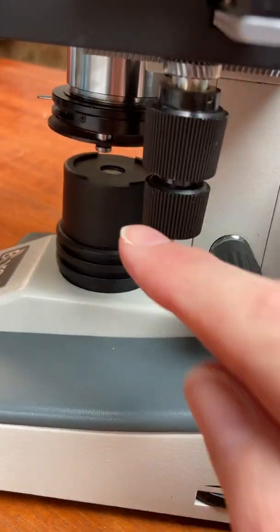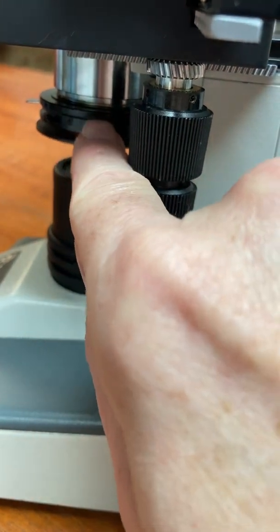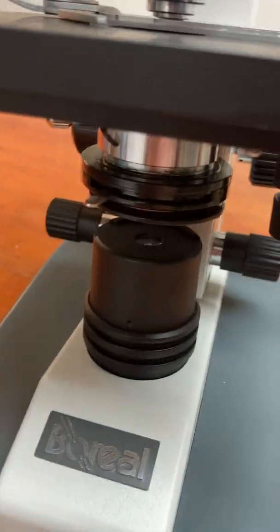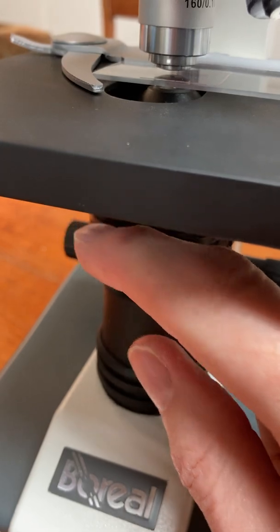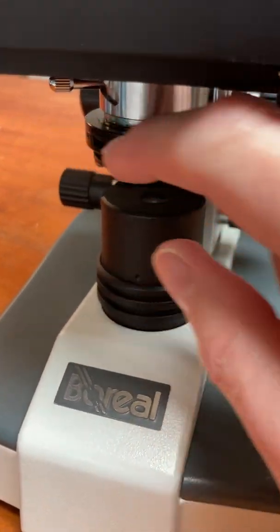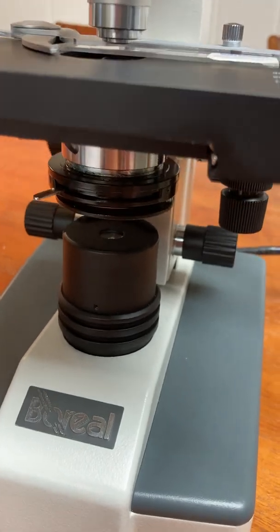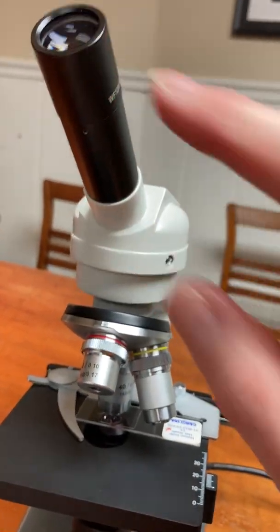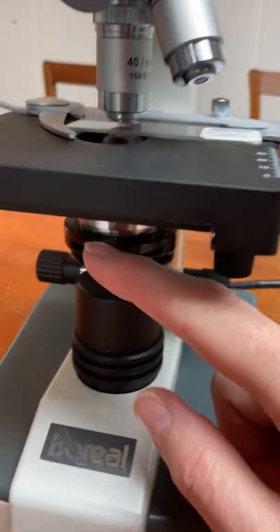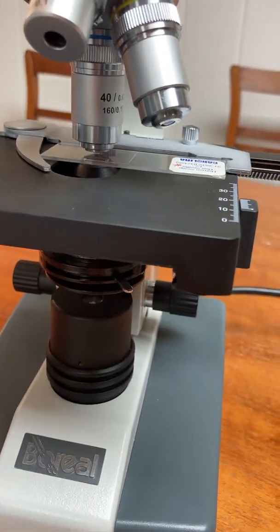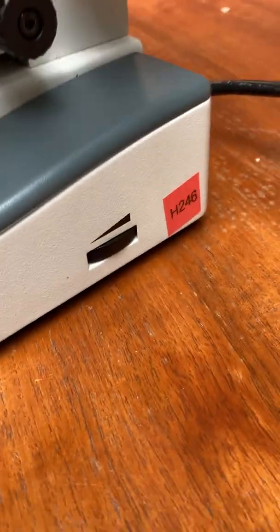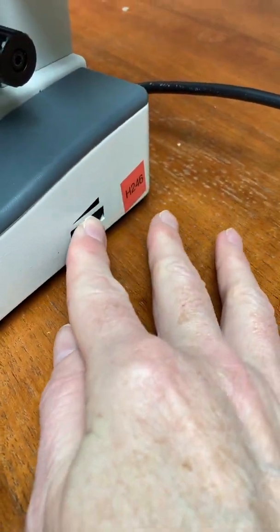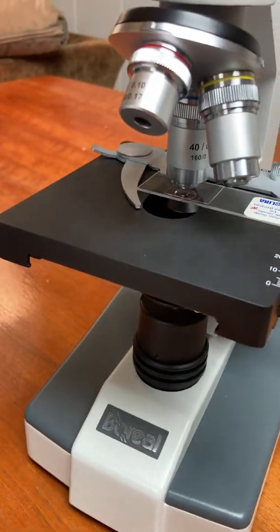Underneath you see above the lamp is this metal lever there. That's called the iris diaphragm lever and it turns right back and forth like this. If you had this microscope on and you were looking through the ocular lens, you would notice that turning the iris diaphragm lever adjusts the amount of light that is allowed to come through because sometimes it's too bright, sometimes it's too dim. We also have this knob on the side, which not all microscopes have, but that will also adjust the amount of light coming through the specimen.